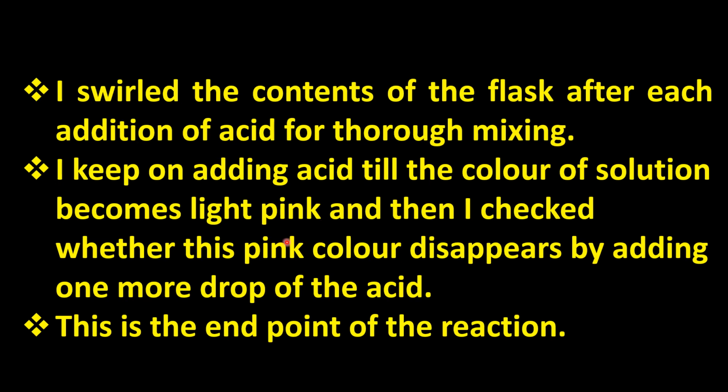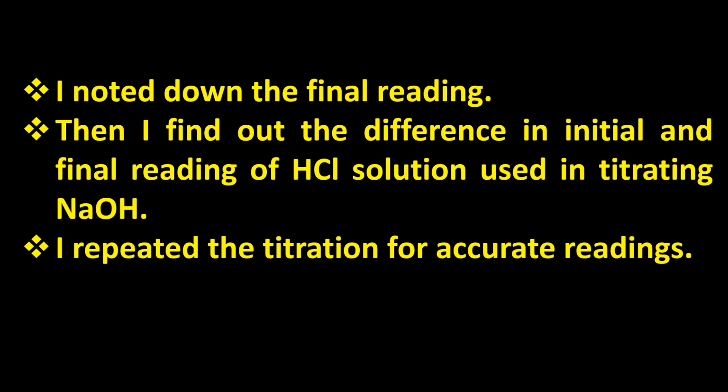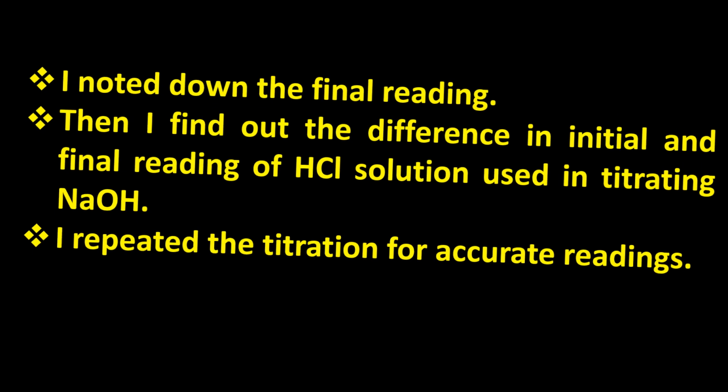And then I check whether this pink color disappears by adding one more drop of the acid. At the end, I just have to add one more drop to check whether my end point is clear or not. So that will be the end point of the reaction. Then I have to note down the final readings. Then I have to find the difference between the initial and the final reading of hydrochloric acid solution used in titrating sodium hydroxide solution. And please remember that you have to repeat the titration for accurate readings.